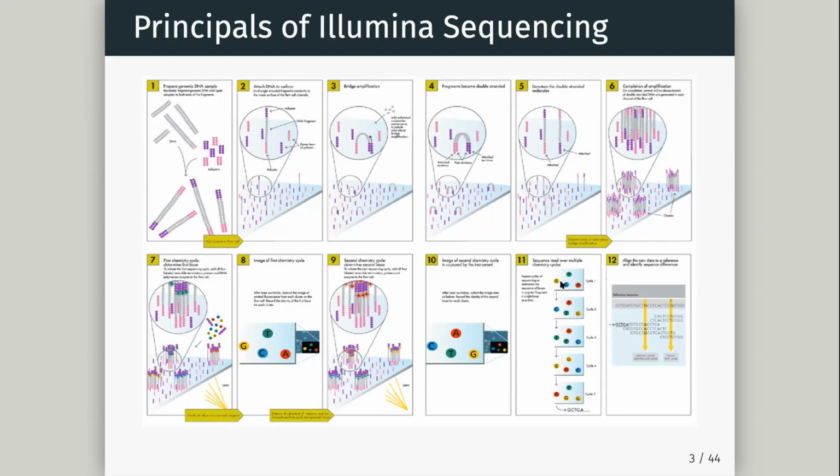You often never see this. This will be run by your genome center. And effectively what that does is turn these stacks of images into sequences. Okay, so given the colors fluorescing in the different cycles, I can then say, oh, I have a sequence of AC, AG, CC for this particular cluster, and that will be one of my reads.